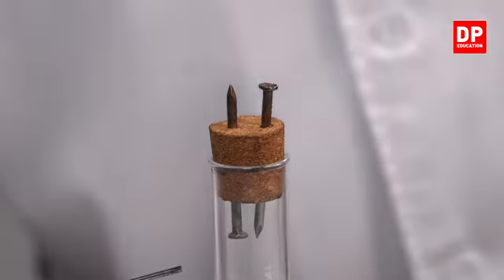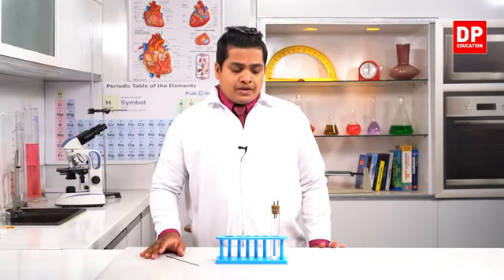The reason for this is, as I told you earlier also, calcium chloride can absorb water vapor or moisture. So when I insert the stopper, some amount of water vapor gets trapped inside the boiling tube. So that water vapor is absorbed by calcium chloride. So inside the boiling tube, there is no water vapor at all, right?